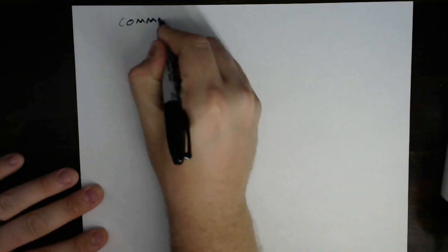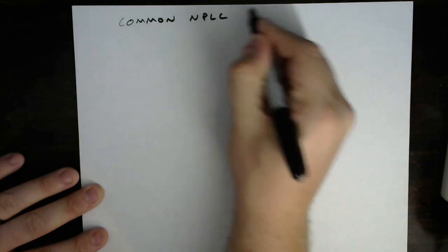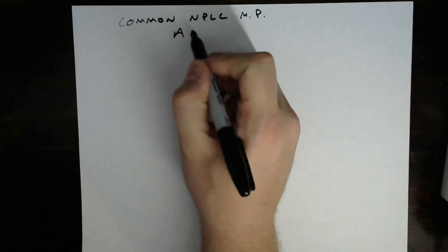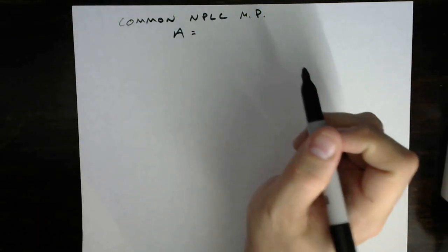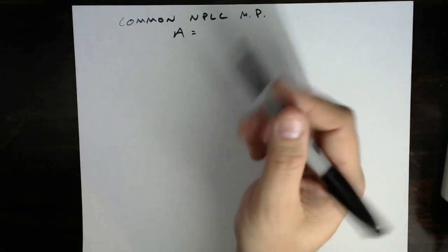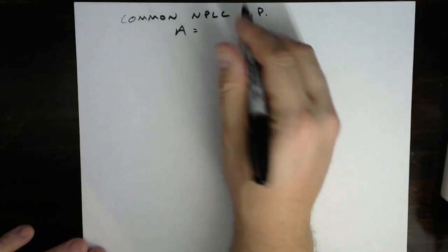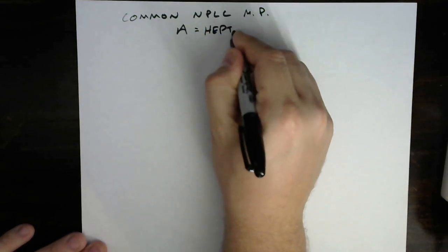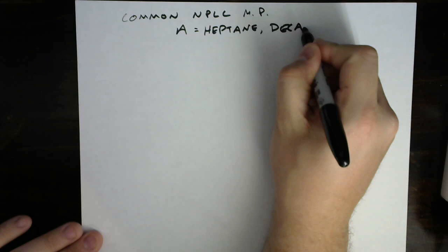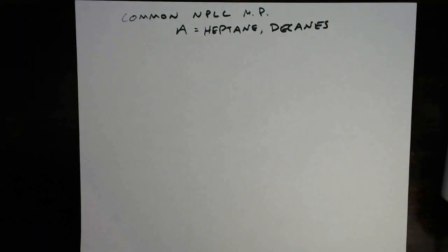So let's look at some common solvents A and B for normal phase. Let's call this common normal phase liquid chromatography mobile phases. Very common for A would be a saturated hydrocarbon, something that is very nonpolar, has a pretty good solvation capacity for nonpolar things. So this would be long saturated hydrocarbons, so heptanes or decanes are really common for this kind of application.